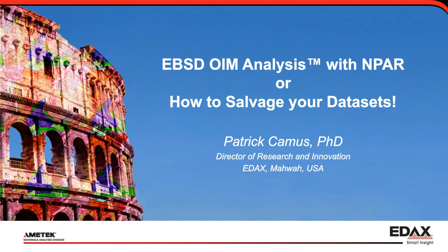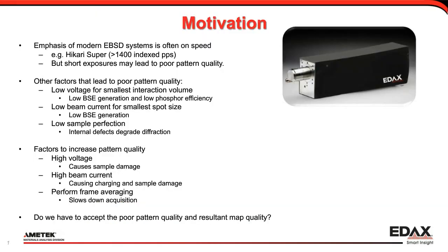The motivation for this webinar is that the emphasis of modern EBSD systems is often on speed. For instance, the specification of our Hikari Super is greater than 1,400 indexed patterns per second. But these short exposures may lead to poor pattern quality in the diffraction patterns. Other factors that can lead to poor pattern quality are low voltage, low beam current, and low sample perfection. Sometimes you have control over these; sometimes you don't. Usually to increase pattern quality, you will want to go to higher voltages, higher beam current, or perform frame averaging — but those are not always amenable.